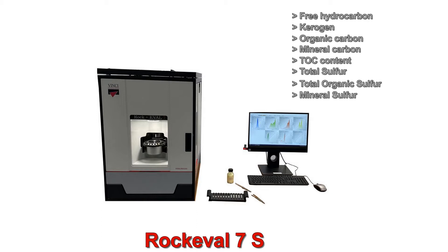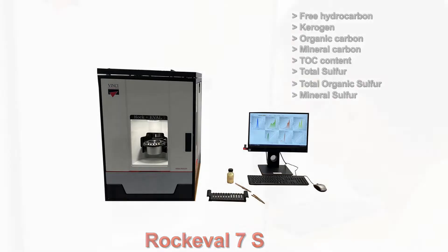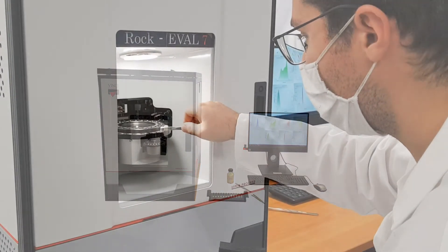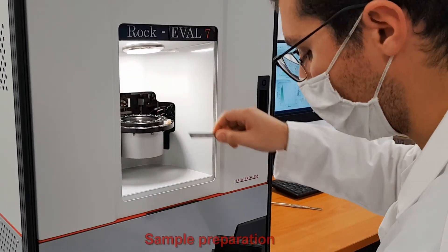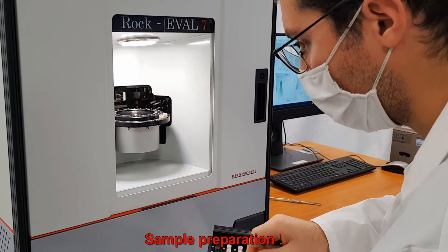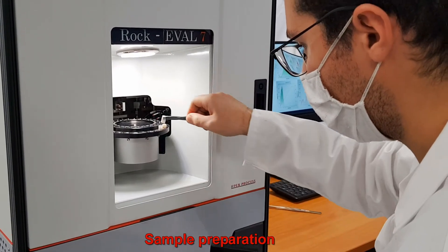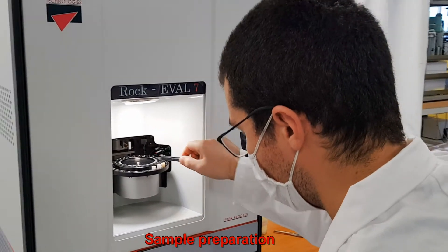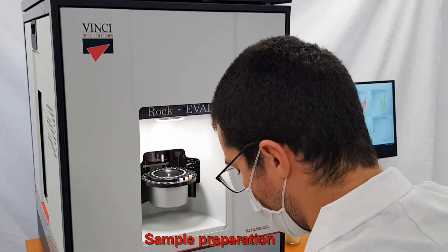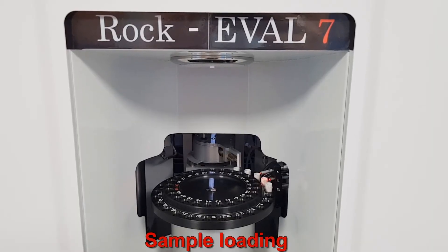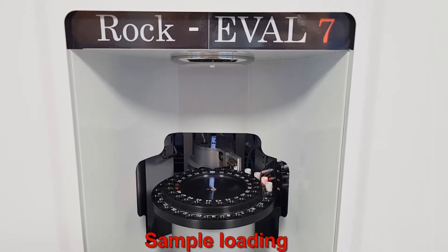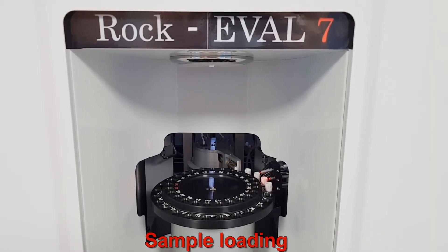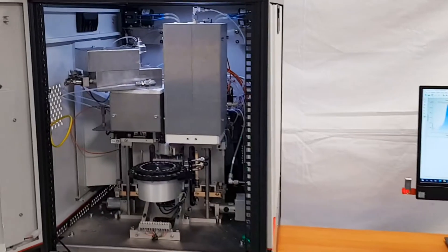Samples include source rocks, reservoir rocks, and soils. Rock samples are powdered and inserted into crucibles, which are then placed into numbered slots on the automated carousel. They are then picked up by the pincer and inserted successively into the pyrolysis and oxidation ovens.